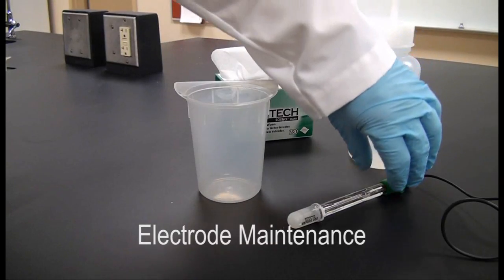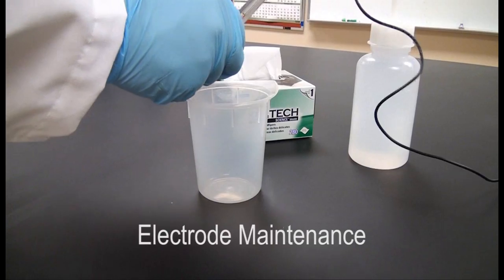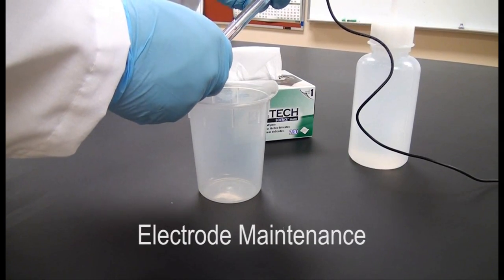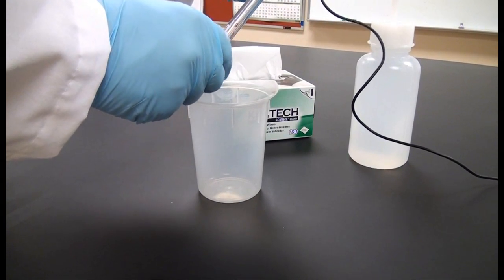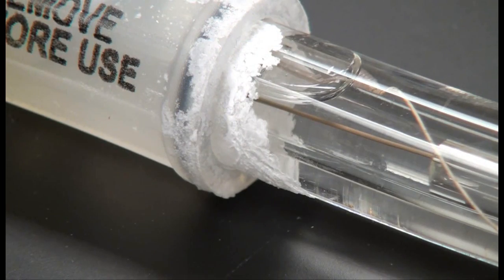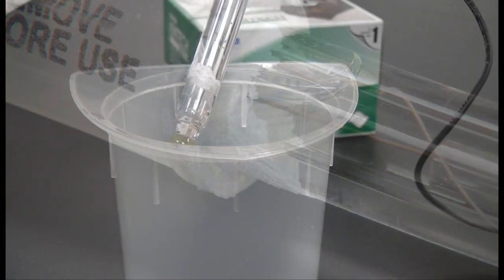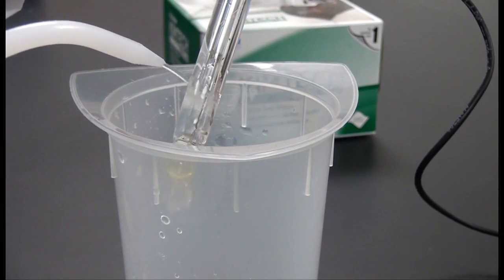Electrode maintenance. Always make sure the electrode is stored in an appropriate storage solution and never allow the electrode to dry out. For maximum accuracy, any filling solution that has encrusted the outside of the electrode should be removed with DI water.